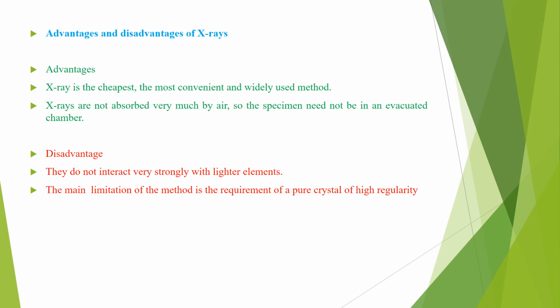And the second advantage of using this X-ray technique is that X-rays are not absorbed very much by air. So the specimen need not be in an evacuated chamber.